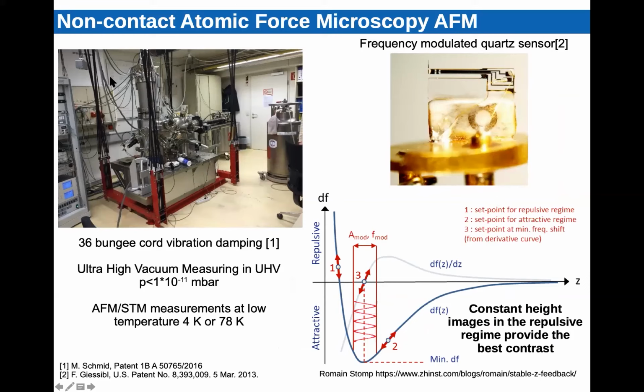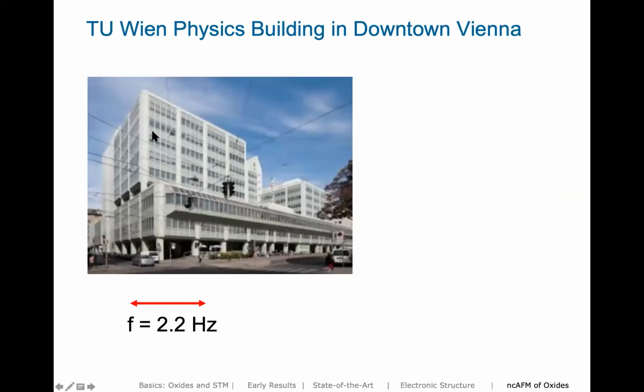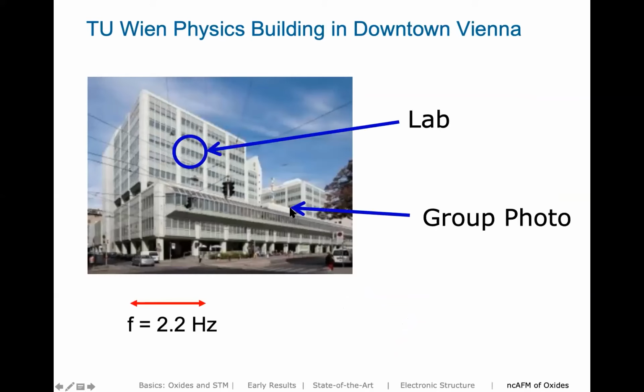This is with us. Here is our UHV chamber. It's a 1-ton chamber. It hangs on these bungee cords. And the reason is, remember my group photo in the beginning? The group photo was taken here. The lab is here. Not a very good situation for constant height measurements. So that's why we had to come up with this bungee cord system. So that works really well. It's very cheap, actually. And we have a little patent on it.